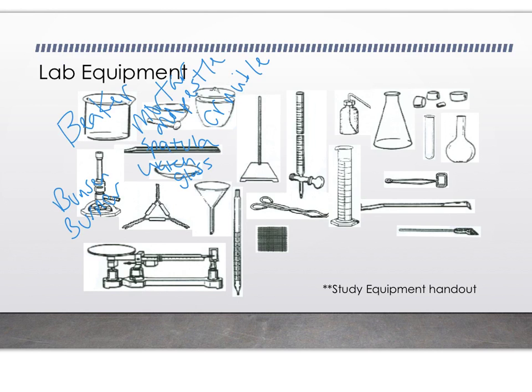So if you have a solid product coming out of your reaction and it's within water, you can put that entire mess of your product on the watch glass, and then you can come back the next day and that water will have evaporated off. The next picture, this is a triangle, and this is what you use to support the crucible whenever you're trying to heat it at very, very high temperatures.